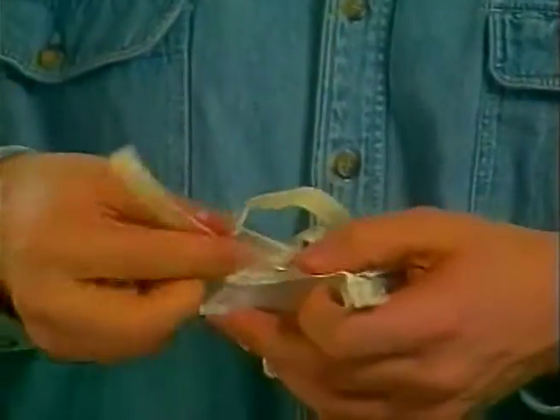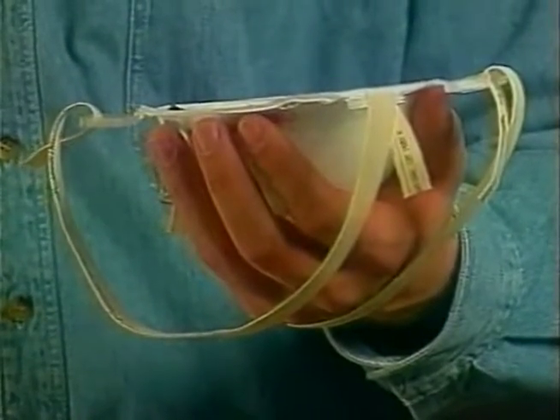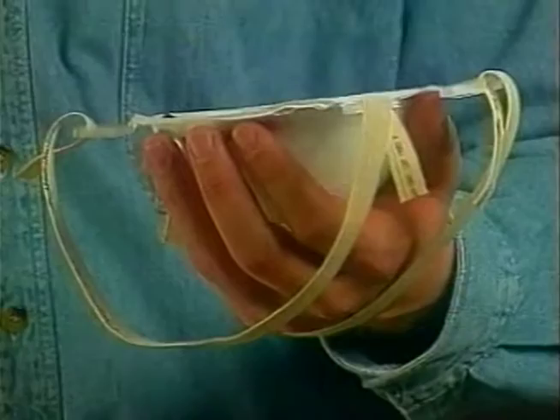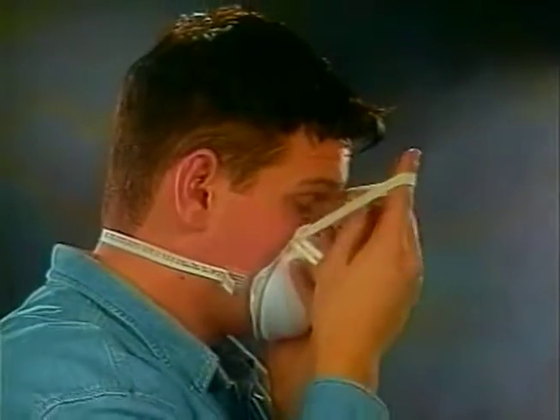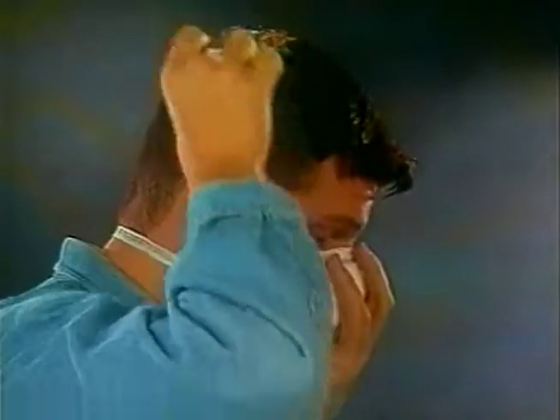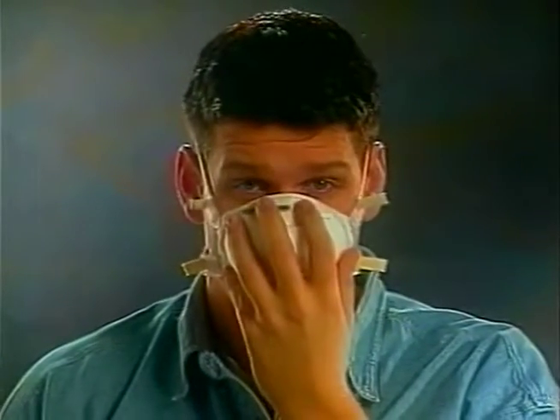If the respirator has adjustable straps, start by running the straps through the buckles. Then hold the respirator in your hand with the nose piece at your fingertips, allowing the strap to hang freely below your hand. Position the respirator under your chin with the nose piece up. Pull the bottom strap over your head and position it around your neck below your ears. Pull the top strap over your head, resting it high at the top back of your head. Make sure the straps are not twisted. Adjust the strap tension by pulling the straps as shown.